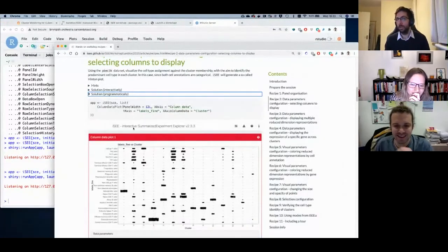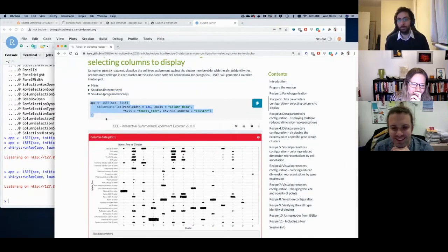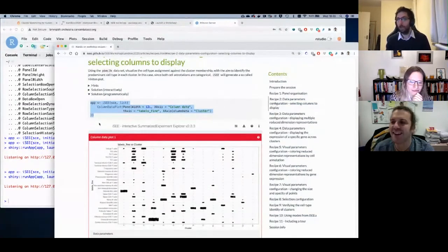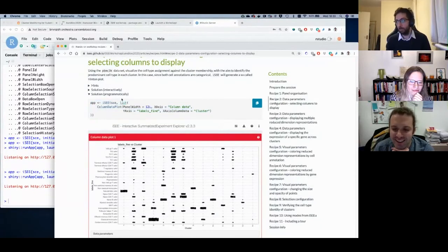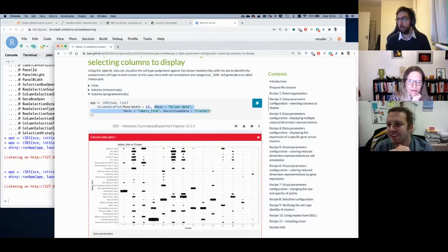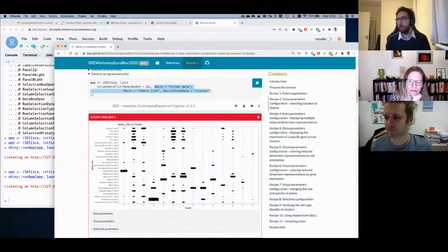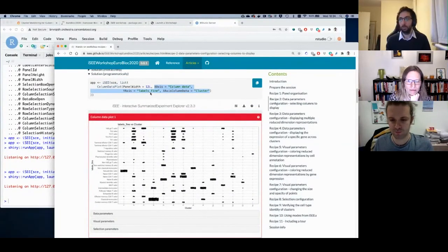The programmatic solution for Recipe 2: `iSEE(sce, initial=list(ColumnDataPlot(PanelWidth=12, XAxis='Column data', XAxisColumnData='cluster', YAxis='labels_fine')))`. Running that app opens directly with the cluster vs. cell-type Hinton plot already configured — saving you several clicks. Screenshots are automatically generated from the coded solution in the pkgdown vignette.